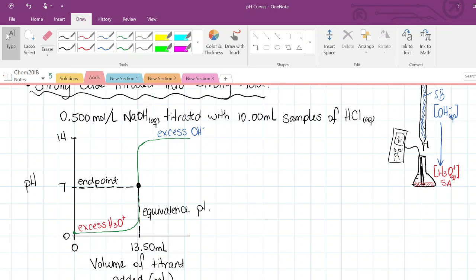But there's going to come a point as we add more and more hydroxide ions to the sample where the hydroxide ions are going to start forcing a pH change because now they're starting to overwhelm the hydronium ions in solution, right? And so as the hydroxide ion concentration increases, you're going to start seeing that there's a curve in this pH data. And if we've got indicator here, that's where that color change is going to start taking place. But as soon as we see the color change, it pretty much disappears.